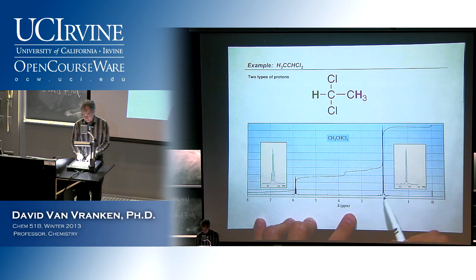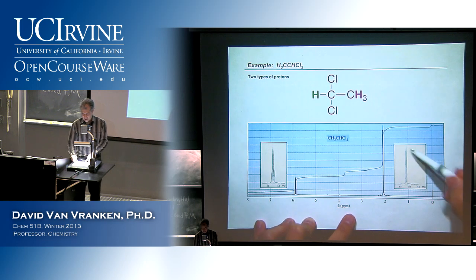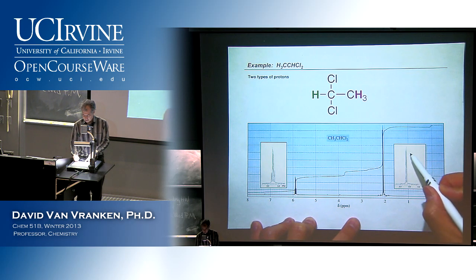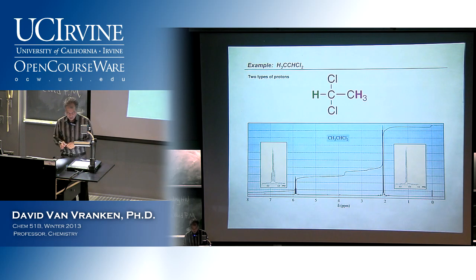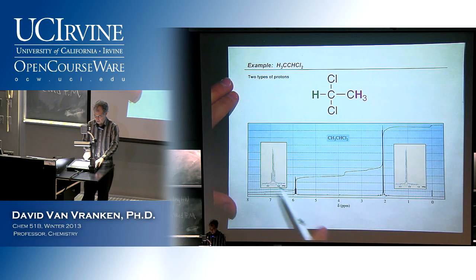And then here's this other peak where you can't quite tell by looking at the blue tiny spectrum. Is that one peak or two peaks close together? But when they give you the expansion, you can see daylight between those two peaks. That's definitely two peaks and not one peak. So two peaks that are close together. And those two peaks are a doublet, pretty clearly. The peaks aren't exactly the same height, but it's pretty close to 1:1. So you see these peak ratios for quartet 1:3 to 3:1, and for a doublet 1:1 ratios.